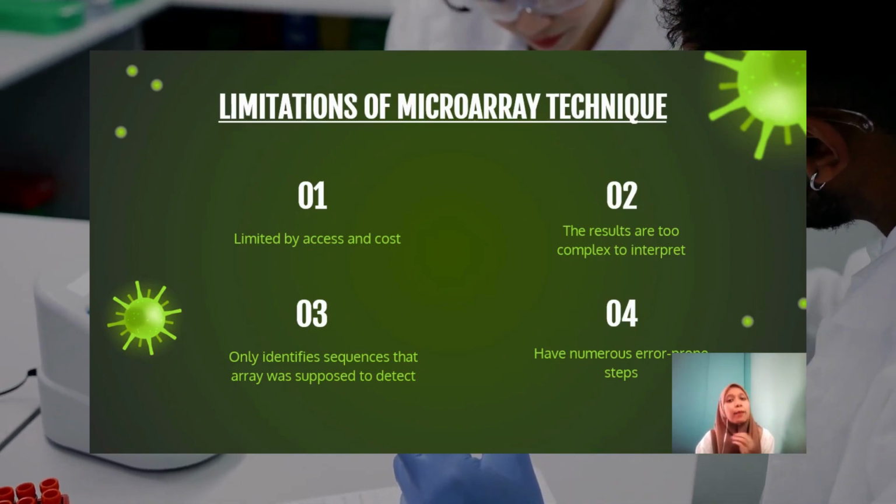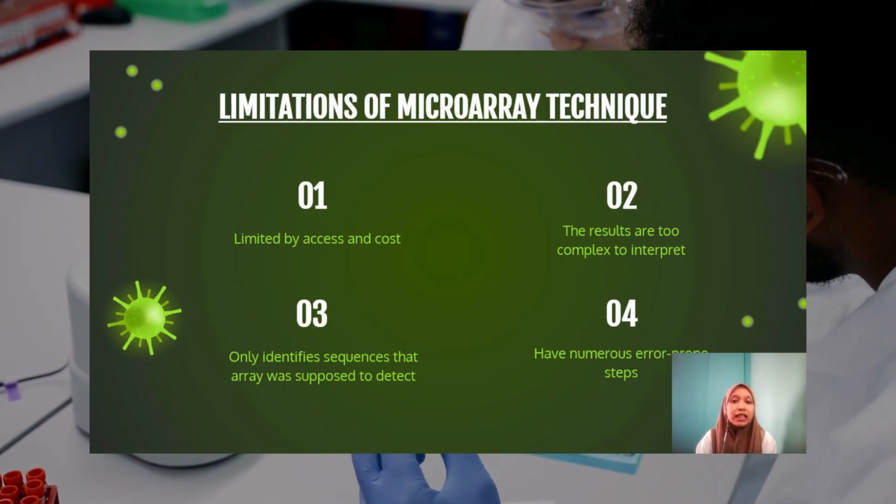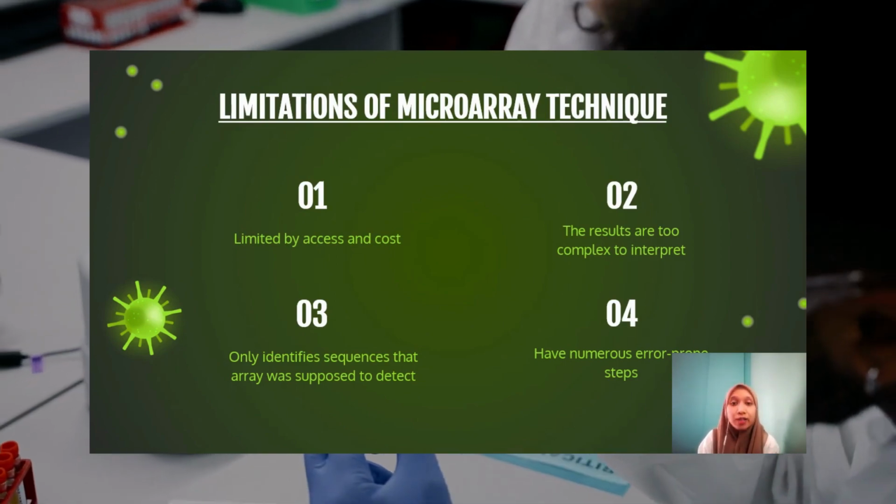And lastly, microarray techniques have numerous error-prone steps. Thus, the experiment needs to be replicated in order to eliminate sources of error.